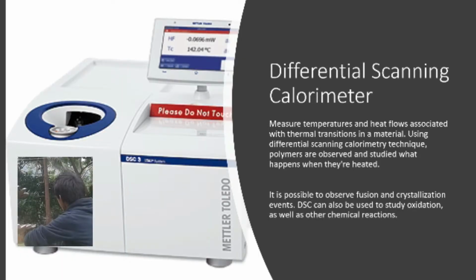The next item would be the differential scanning calorimeter. This item measures temperatures and heat flows associated with thermal transitions in a material. When they use this differential scanning calorimetry technique, polymers are observed and studied for what happens when they're heated. So basically, the main use for this item is to measure the activity of polymers when they are heated, like enzymes or any other inorganic or organic materials. And when they're heated, activity happens when they get heated or when they get denatured.